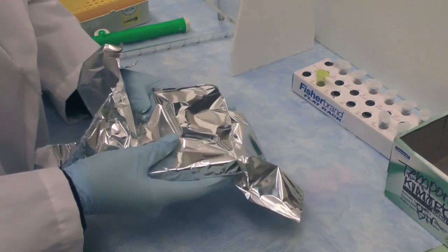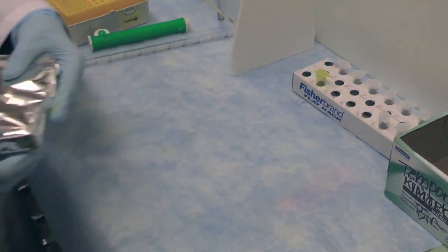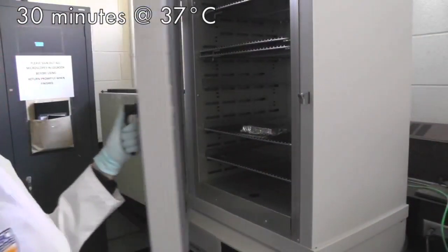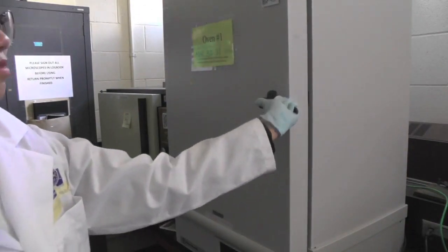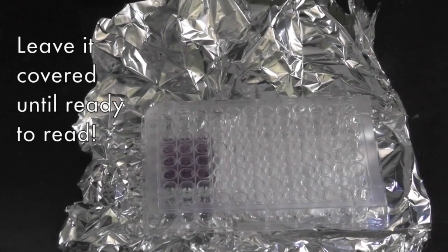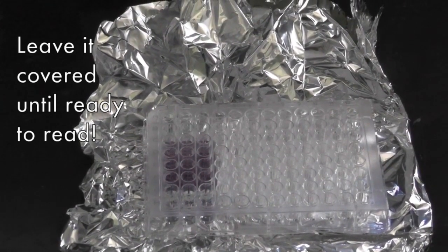Cover the plate with aluminum foil and place it in a 37 degree Celsius incubator for 30 minutes. After incubation, take the microplate out and cool to room temperature.